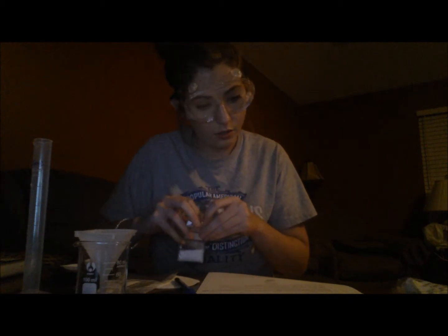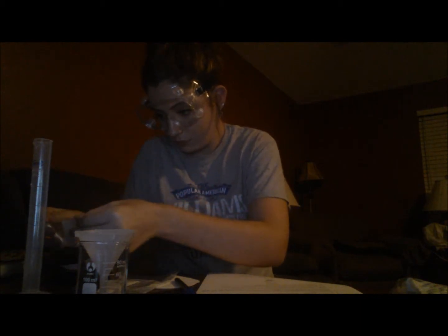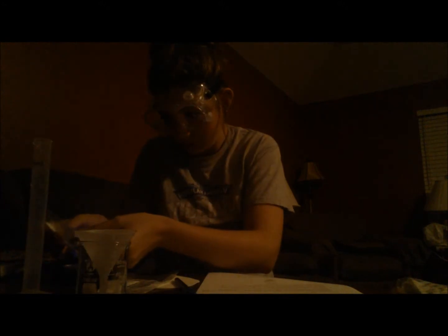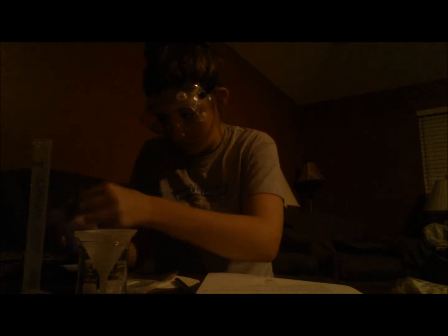Okay, 1 gram. So I'm going to zero out the machine. There we go, 1 exactly.